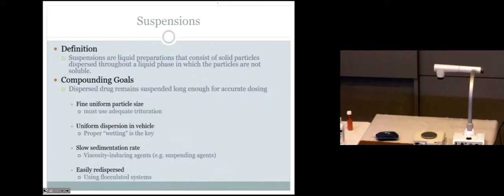So that word, remember, are you already sick to death of triturate? Okay, and geometric dilution, right? So another key term, though, for your procedure, and it's really important today, is wetting the powder. And I'll talk about what that means here, is essentially, I always try to do an analogy. I don't know if it works or not. Have you ever taken a glass of milk, tried to make chocolate milk with the powder? You take this milk and you scoop some of the powder up and you put the powder in the top of the milk and then you stir it, and what does it do? It just all clumps together and floats around at the top.